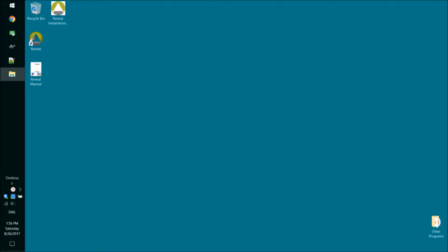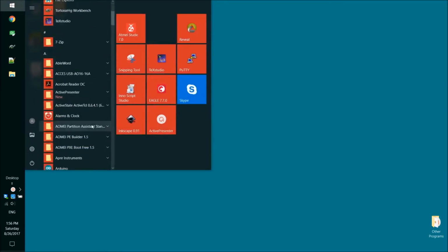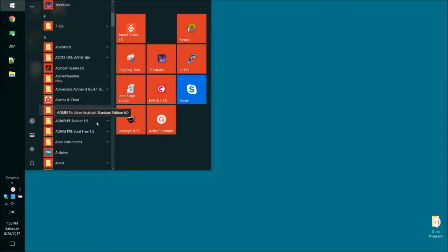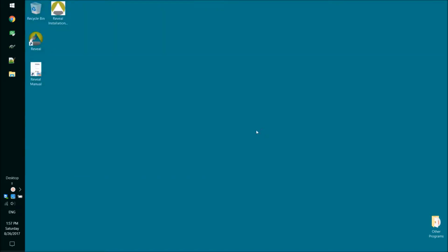In this video, we will show you how to update your existing Reveal installation to a newer version. In this case, we are going to start with the Reveal version 1.3, which is installed on this computer. And we're going to install the newer version 1.4 following this simple process.